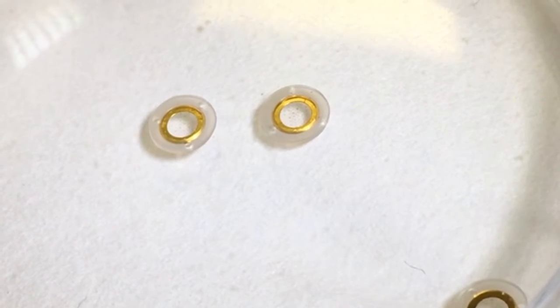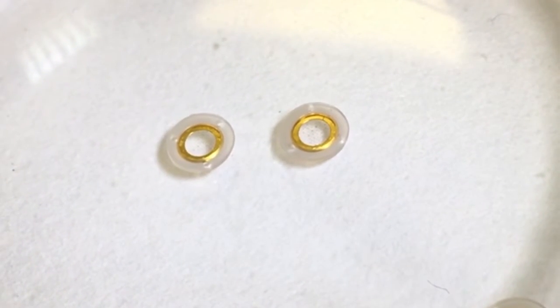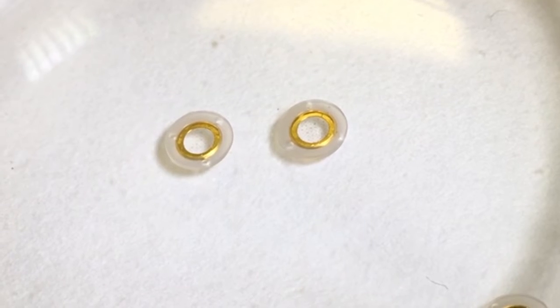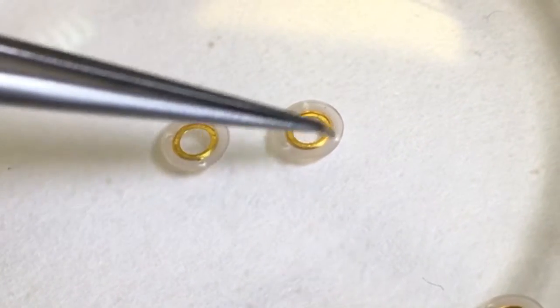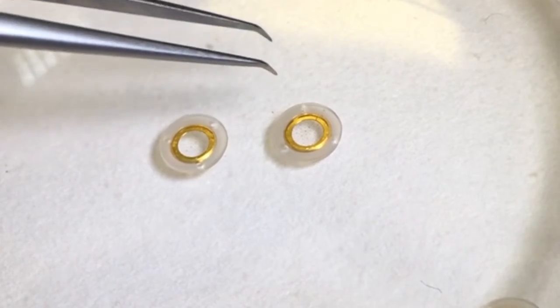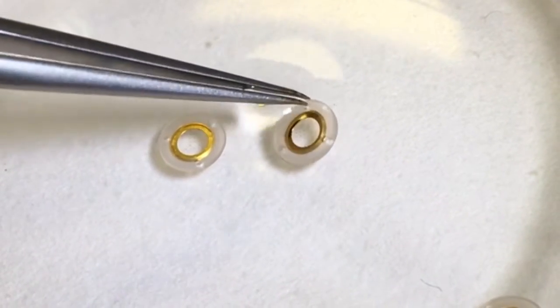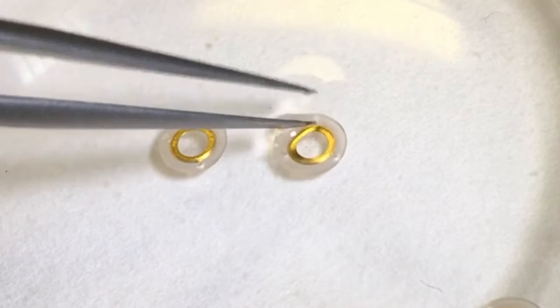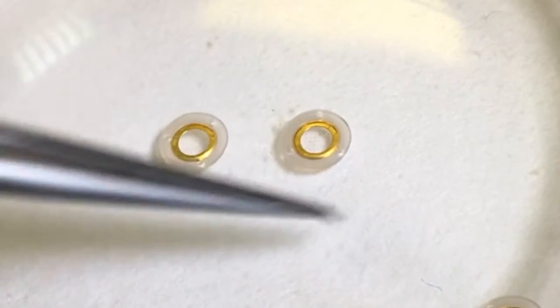The first thing is to detect the capsules and culture your cells of interest directly inside the capsule. As I said before, the capsule is kind of a small petri dish where you can see here a gold spacer ring and the different landmarks, and the cells are growing all around.